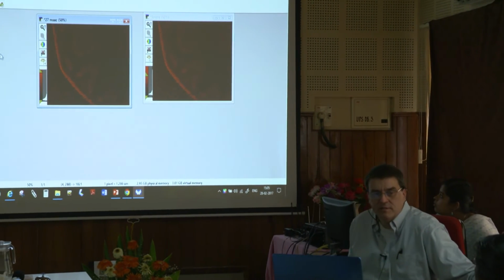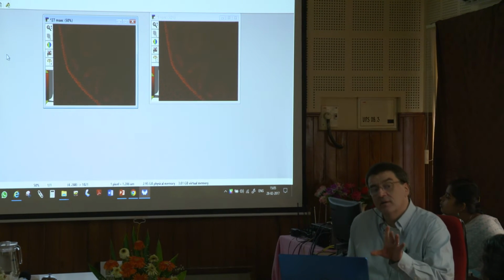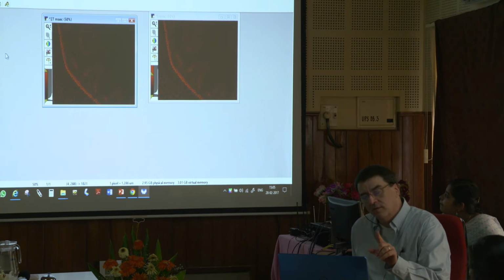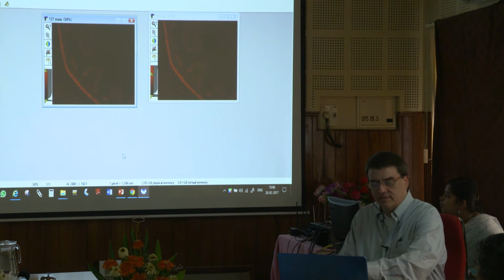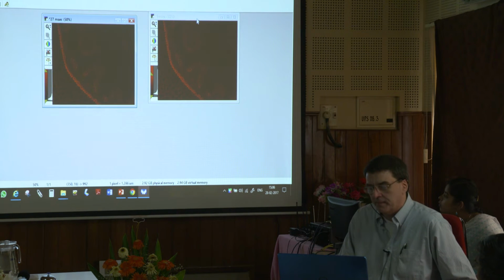One of these is a good image. One of these is an absolutely horrible image. But they look the same, okay? Why is one good? Why is one bad? What did I talk about earlier? Remember what I talked about? This number right here, right? This is the same picture. I did this one at 27 milliseconds. I did this one at 5 milliseconds on my camera.